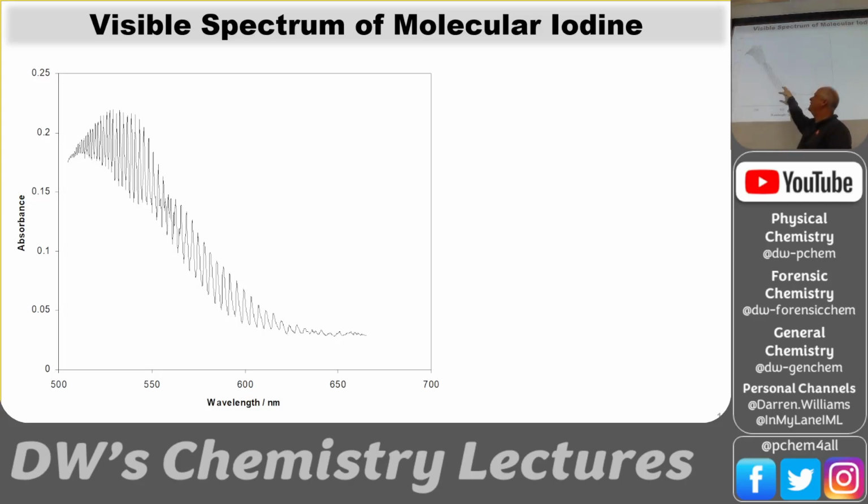It's great. So you can do the same kind of thing. So what we're going to do is analyze every one of these peaks. These little bumps are real. These bumps are the vibrational transitions on top of an electronic transition. So this is a lot of peaks to assign, but you can do it.